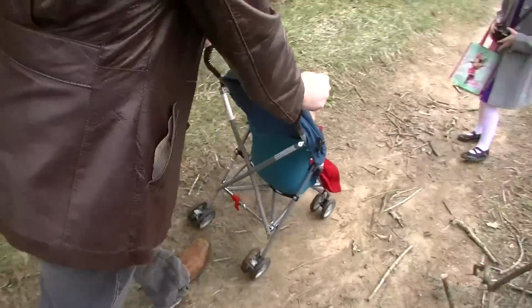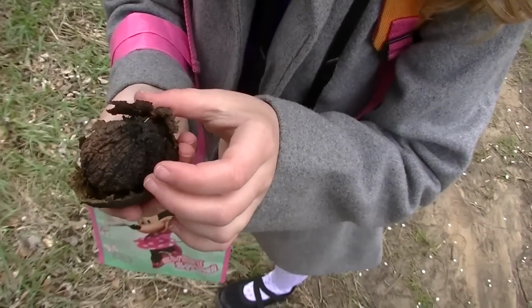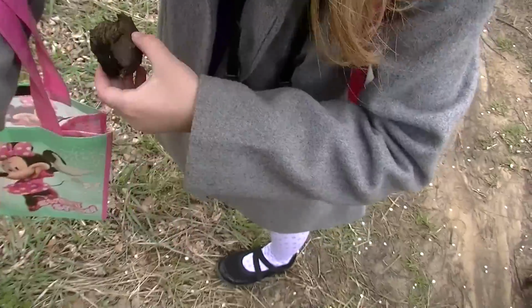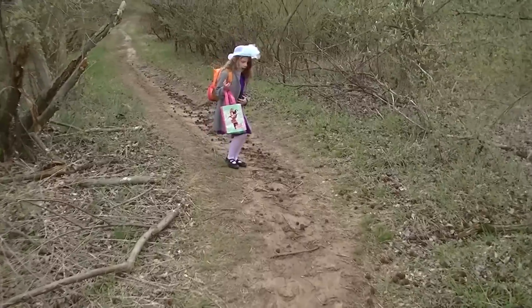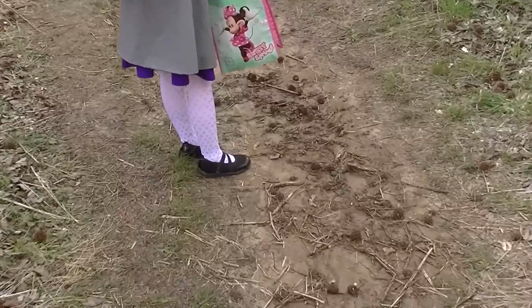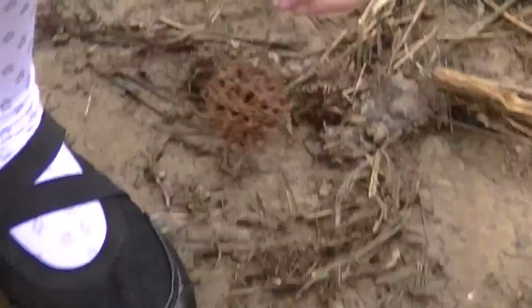Okay, guys. Ooh. No, what is it? Oh. There's a little dude in there. Gonna put it in here. Okay. We've got to pick up one of these cockleburs. Okay, pick one up. Let's collect one for our specimens. Have to be careful, they're spiky. Okay, pick one up with the stem, so we don't get spikes.